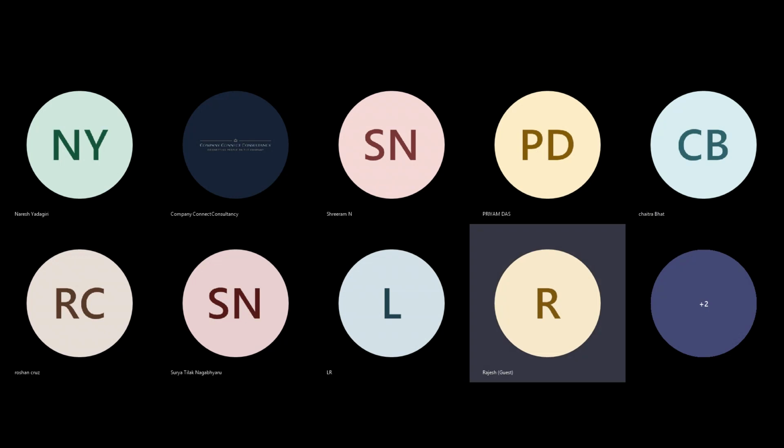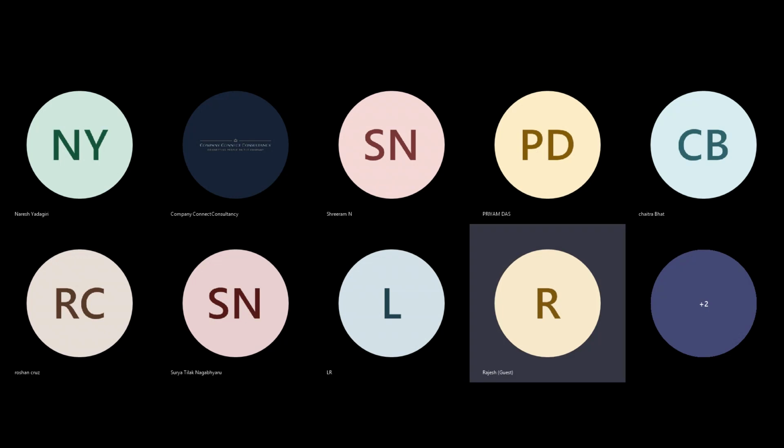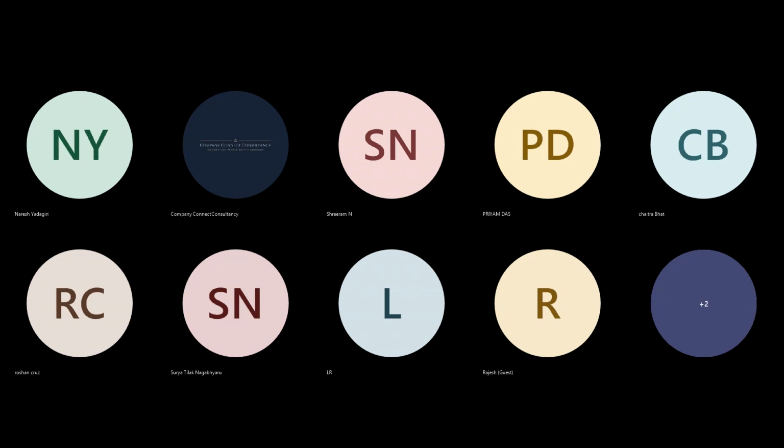Sir, before starting, I have one question. Yeah, sure. So now we are going to discuss LabWare LIMS from the front end point of view, or admin data creation point of view, sir. Going ahead, in the later sessions, we'll show both from the front end and back end.